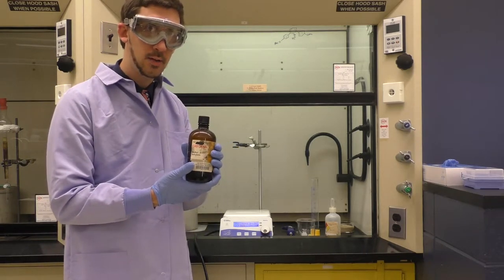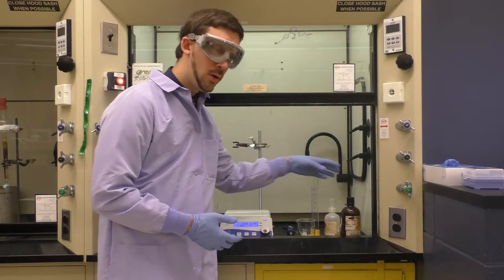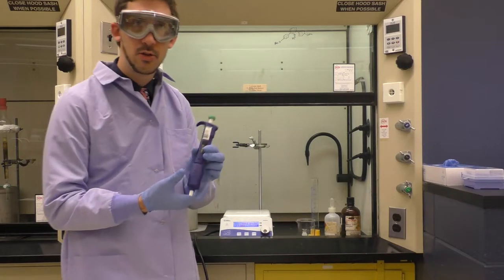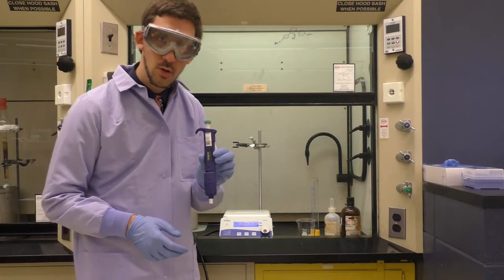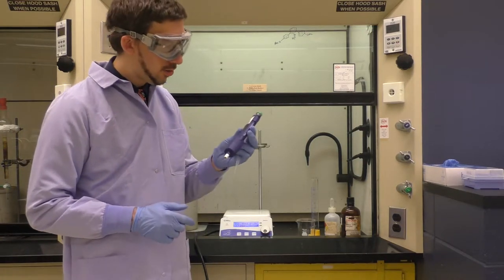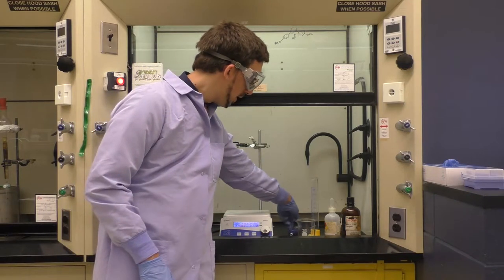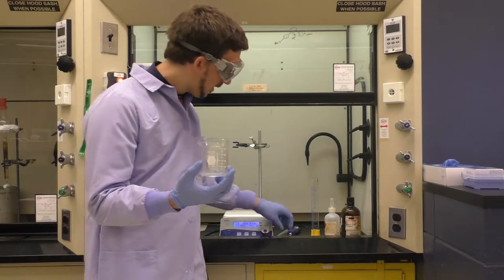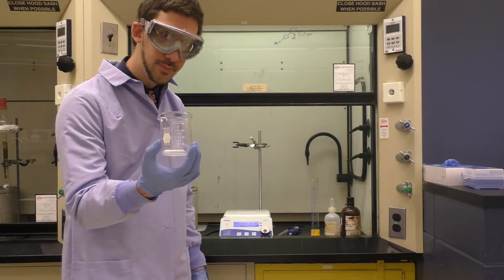Now I could use a graduated cylinder, but in this case, I actually have a handy large micropipette that I can set to 4 milliliters. So this is larger than a normal micropipette, but this should give me reasonable accuracy for that. So I'll measure that out into a reasonably sized beaker here with the added stir bar to agitate the solution.